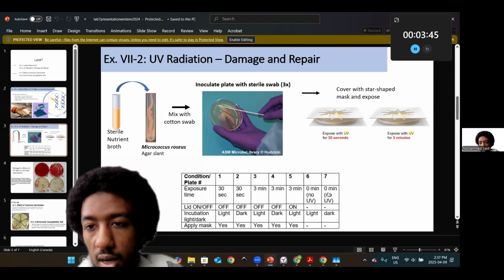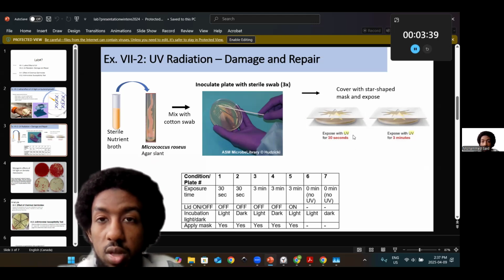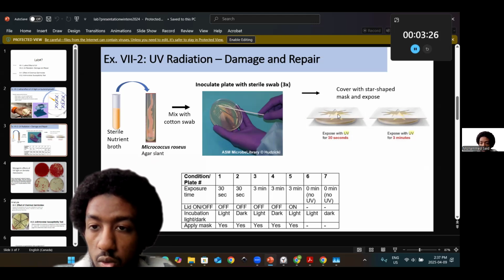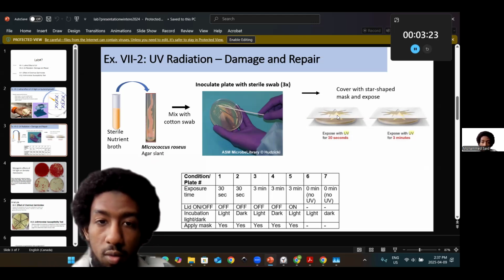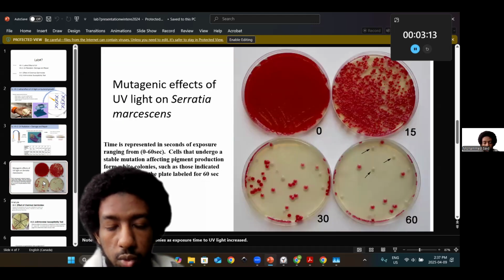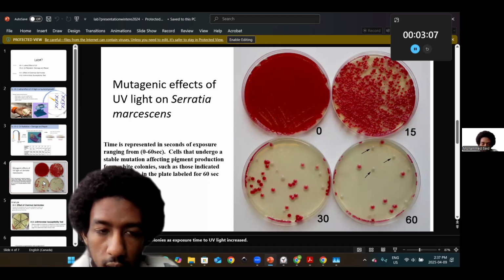And then for applying the mask I mentioned earlier, even though you may have these sets of controls within your single plate, it's also beneficial to see if the outside, in the essentially shaded or masked regions, does indeed serve as a control, i.e. you still find growth, whereas with the UV exposure there's limited growth, or there appears to be a few single colonies that could be resistant or could have repaired following UV exposure, post incubation or during incubation.